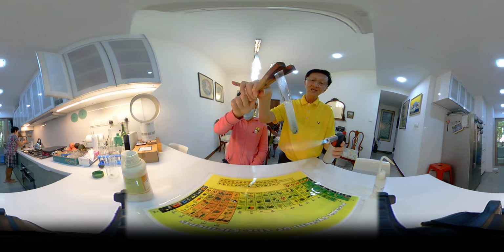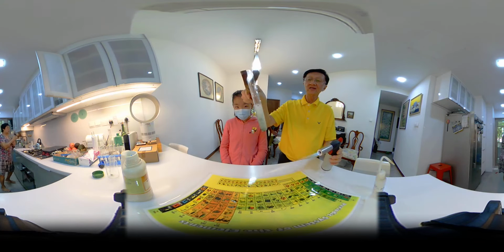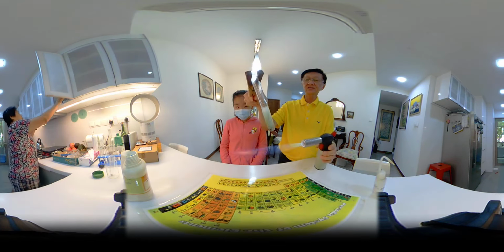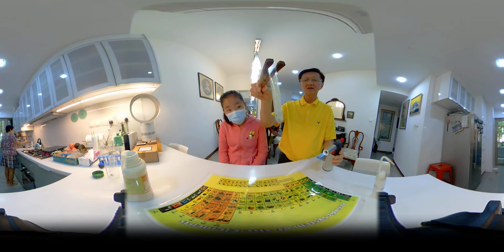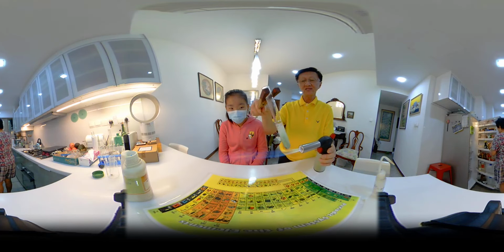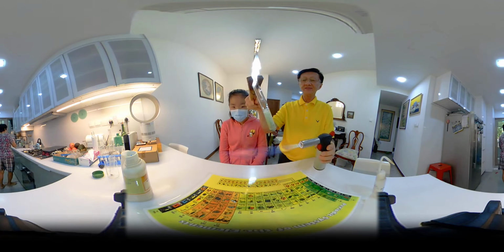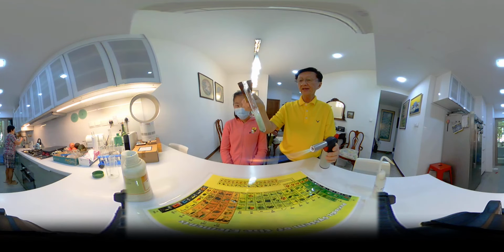Can you see? There is actually a reaction and the color of the solution turns. What color is that? Green, right? It turns green. And as I mentioned before, there was a green solid and now it turns green.